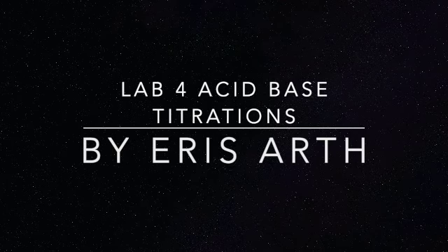Hello, and welcome to Lab 4, which is our acid-base titration lab, and I'm going to be explaining everything from the pre-lab right now. Okay, so the purpose of this experiment is to analyze the percent of the acetic acid by using titration and to determine the molarity and percent of mass.